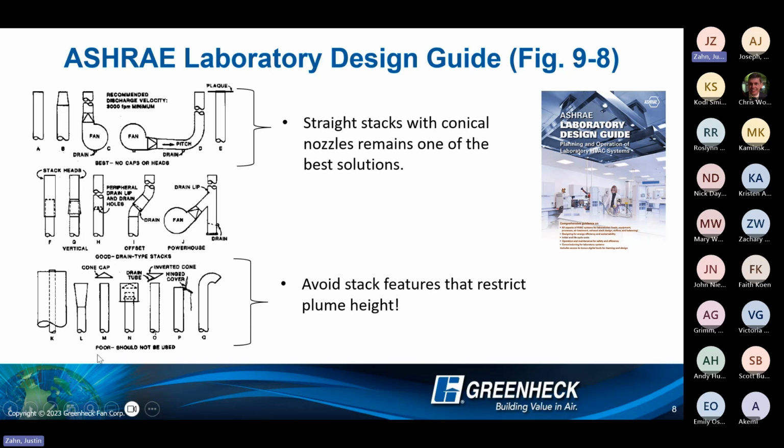The worst way to go, we'll move to the bottom of the screen here, is you're going to notice this gooseneck here on the side. All I can say is please don't do that. We run into some pretty, I'll say, unique situations when it comes to the laboratory exhaust world. We see a lot of different questions come in. One thing we always recommend is please do not add a gooseneck type stack on to these laboratory fans, just because it completely defeats the purpose of these fans.